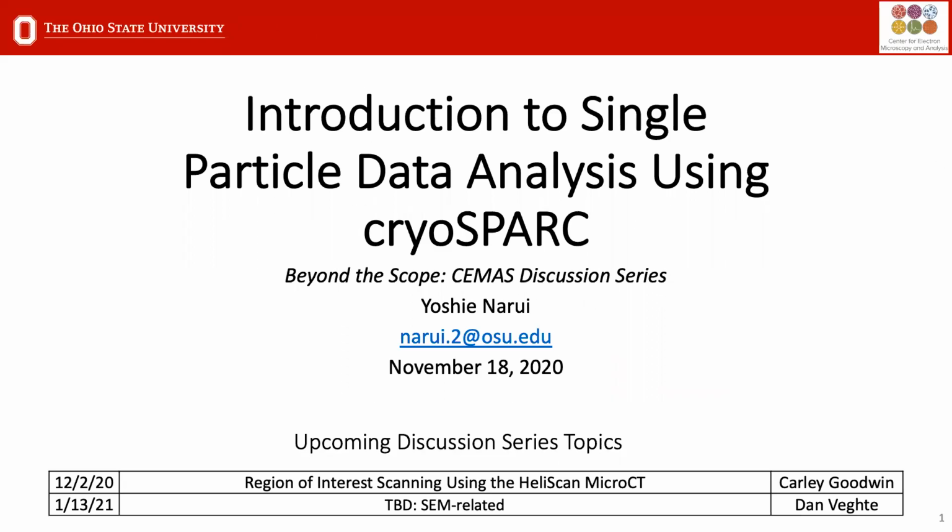This gives you the overall view, but the main thing is you wanna get rid of all of these particles that are obviously garbage or junk. And that's why you need to do 2D classification: to clean up the data.